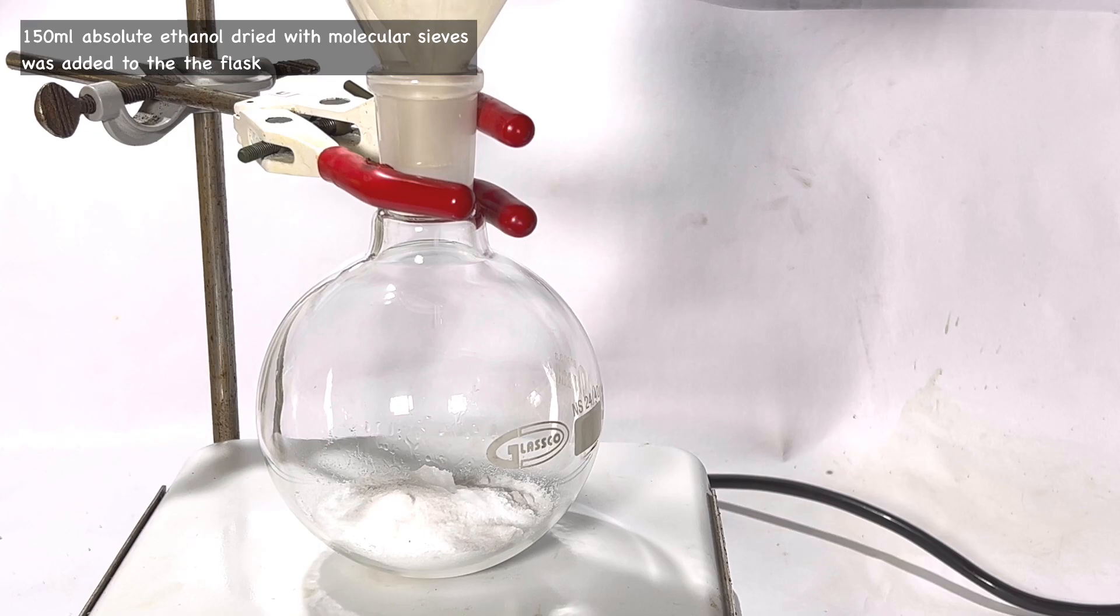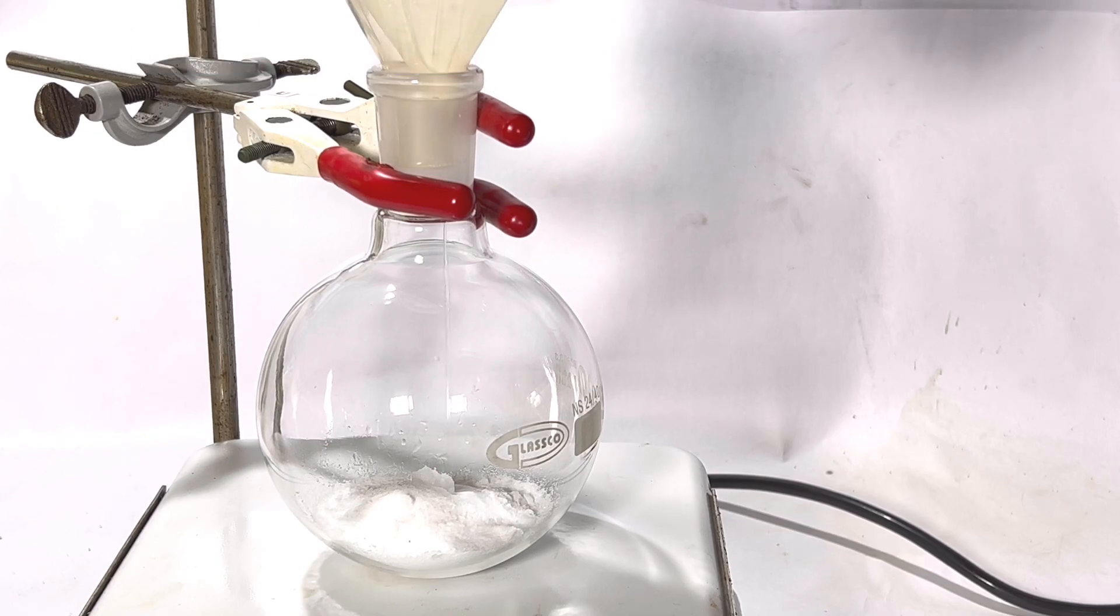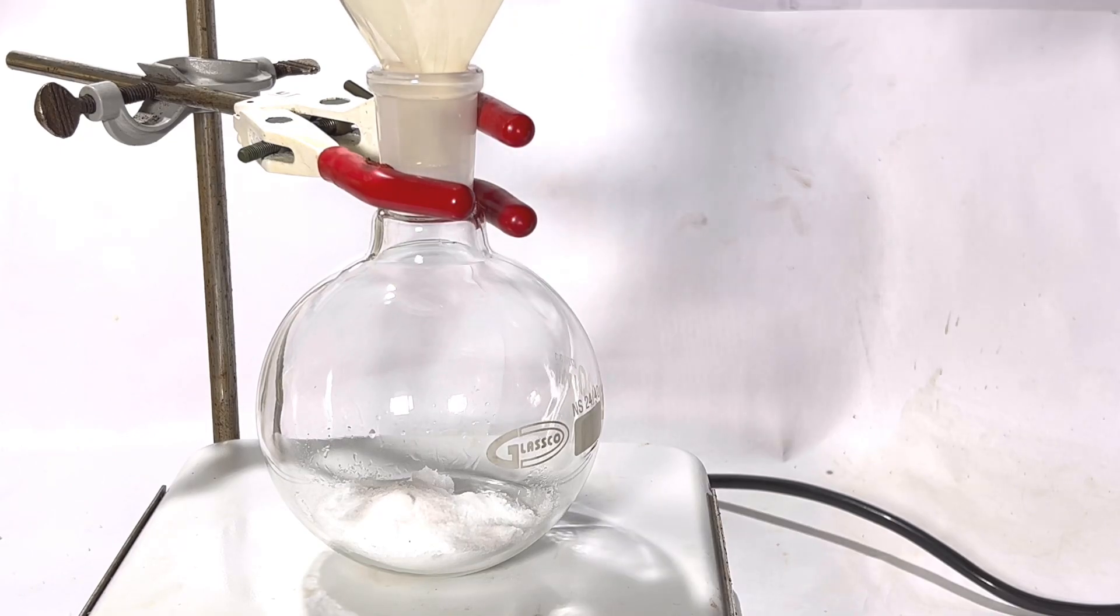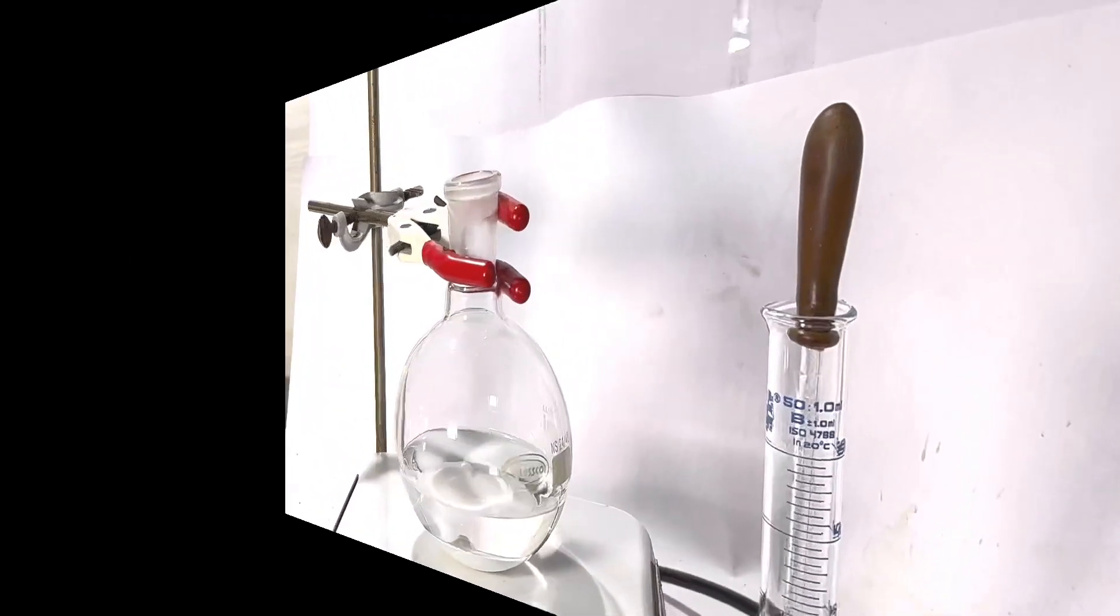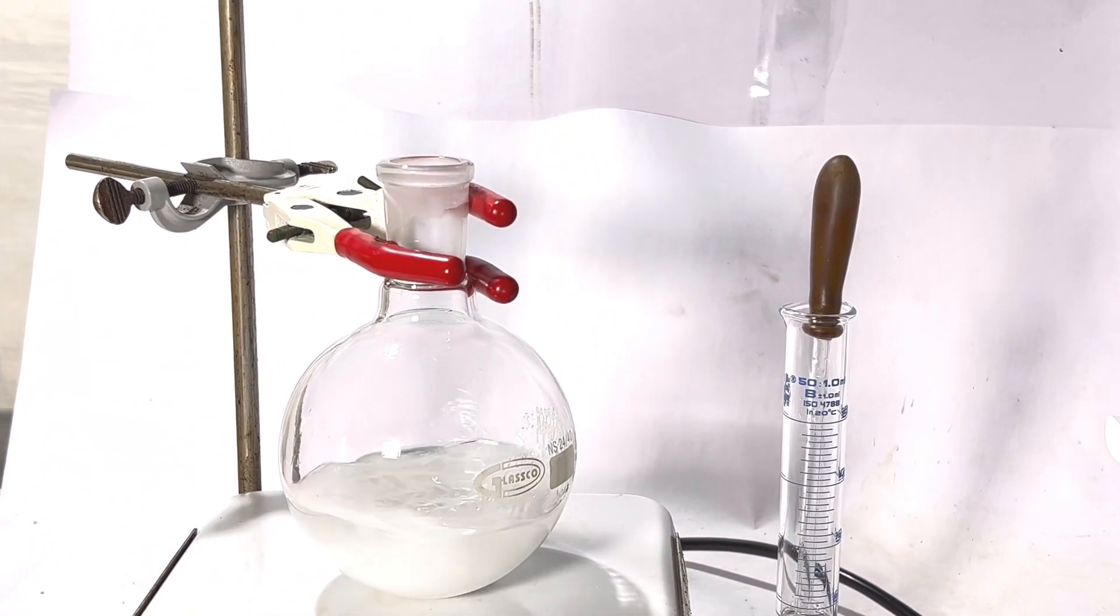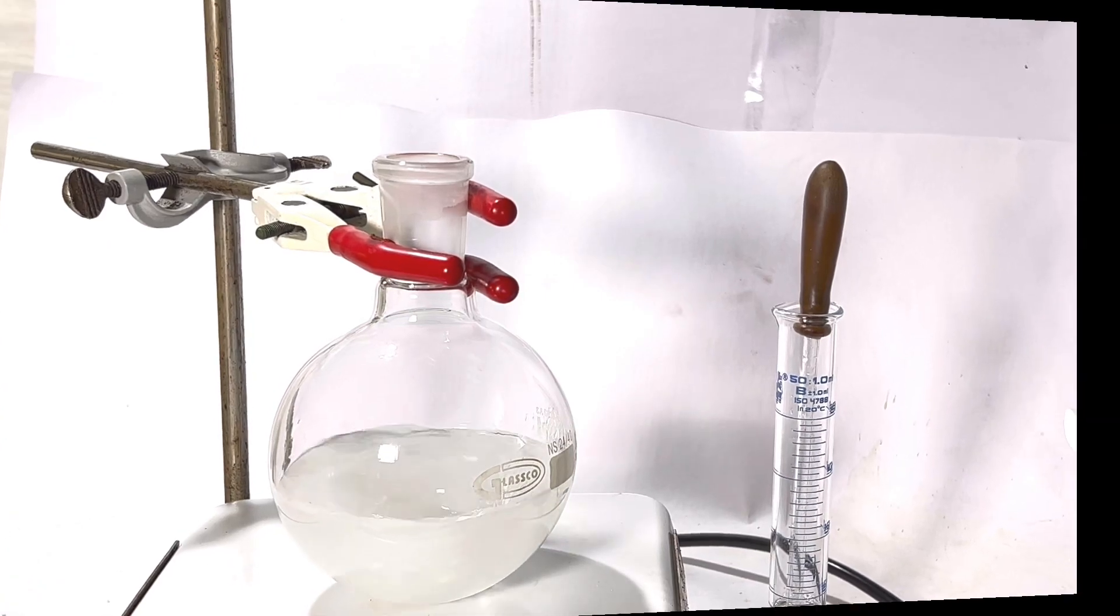Now 150 milliliters of molecular sieve dried absolute ethanol was transferred to the flask. Since the ethanol contained minute particles from the molecular sieves, a simple filtration was conducted and the filtrate was collected in the round bottom flask containing the malonic acid. After all the ethanol was transferred to the flask, stirring was turned on to dissolve the compound. Malonic acid dissolves in ethanol resulting in a clear solution.